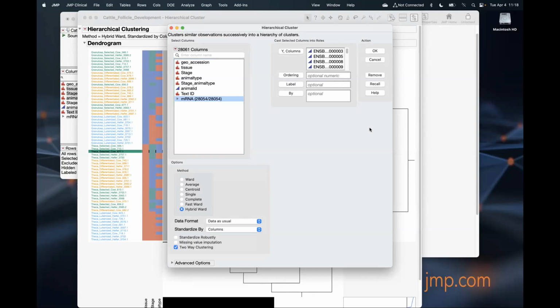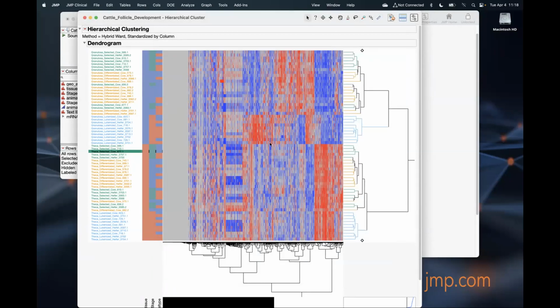And we have some help here for you if you want to learn more about those different methods right there. And that's all I did, right? Done. You could put a label. I tend to do that right here. That's why I created that text ID, and I use that as my label. Now I made it convenient to find my samples. So that was my first step, right? Got some issues. Great.